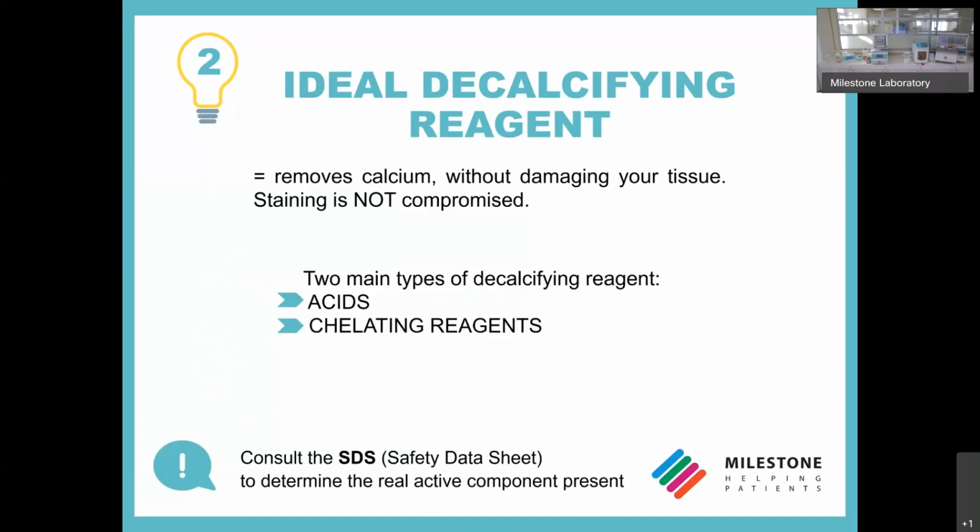Secondly, you absolutely need to use a good decalcifying reagent. The ideal one is the one that completely removes calcium without causing destruction and adverse staining. For convenience, most laboratories choose the many proprietary reagents available, but I suggest you consult the safety datasheet to determine which is the real active component present.